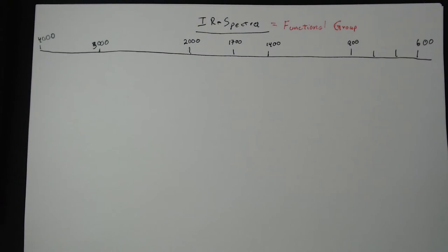Hello students, I'm Professor Hammond and today we will be talking about infrared spectroscopy and NMR spectroscopy. Infrared and NMR spectroscopy are part of nearly every chapter set of problems for the entire semester of 242, and it's useful if you know how to use and do your NMR and IR nearly instantaneously. So we're going to start with infrared, or IR for short, spectroscopy.